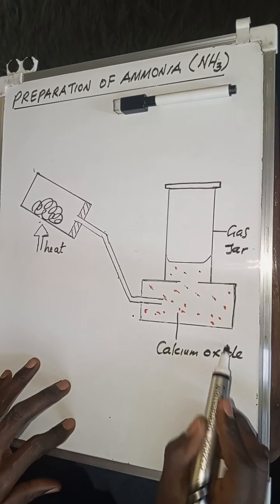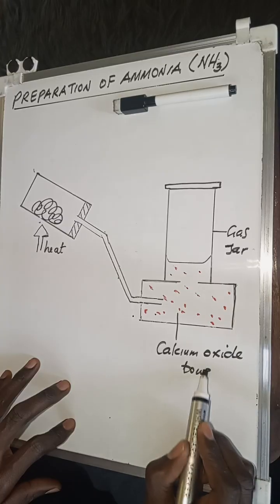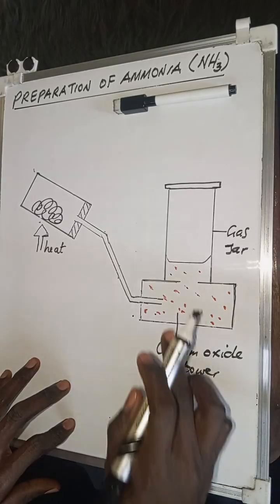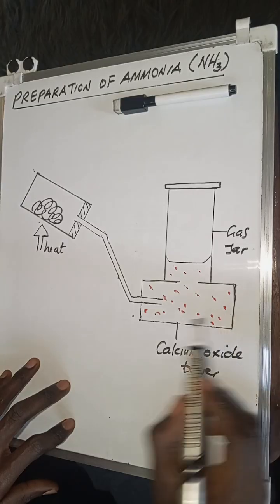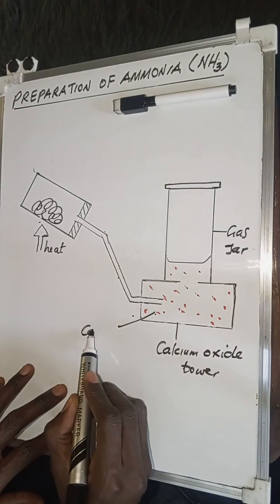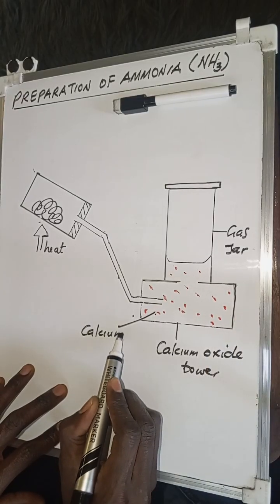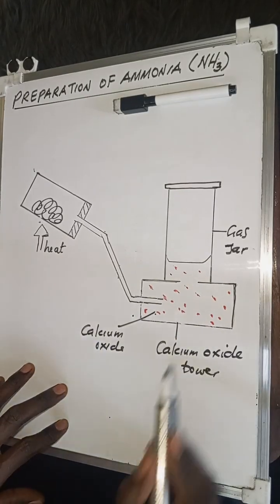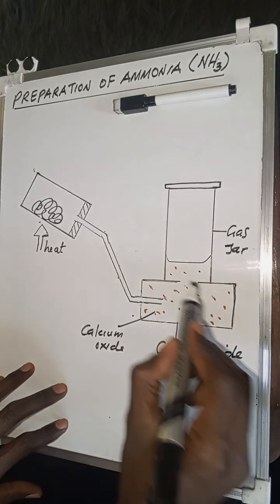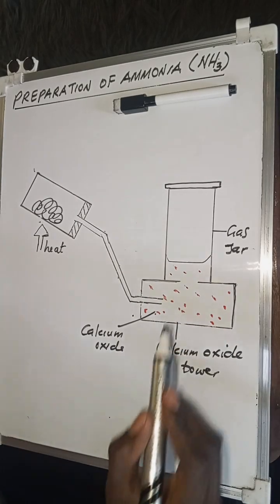So this is a calcium oxide tower. This is the arrangement. Why? Because inside there's actually calcium oxide. You can see I've dotted it in red.